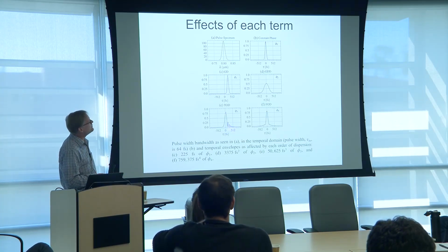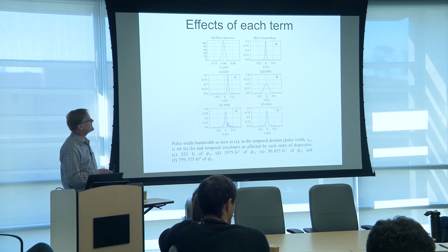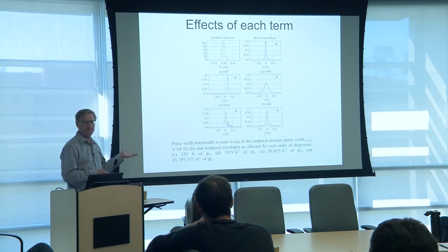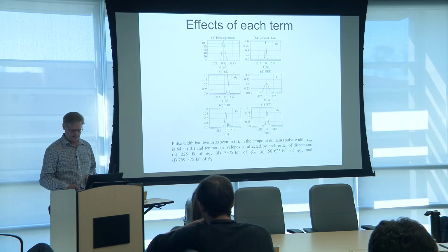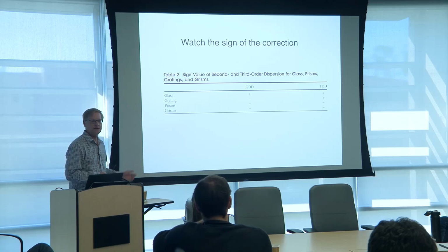All right? So we really want to come up with a way to design a system so I've got something of equal magnitude but opposite in sign. By the time I'm at the focal plane, I'm really looking like this, getting the most efficient excitation. And I think Spencer talked a little bit about this yesterday.